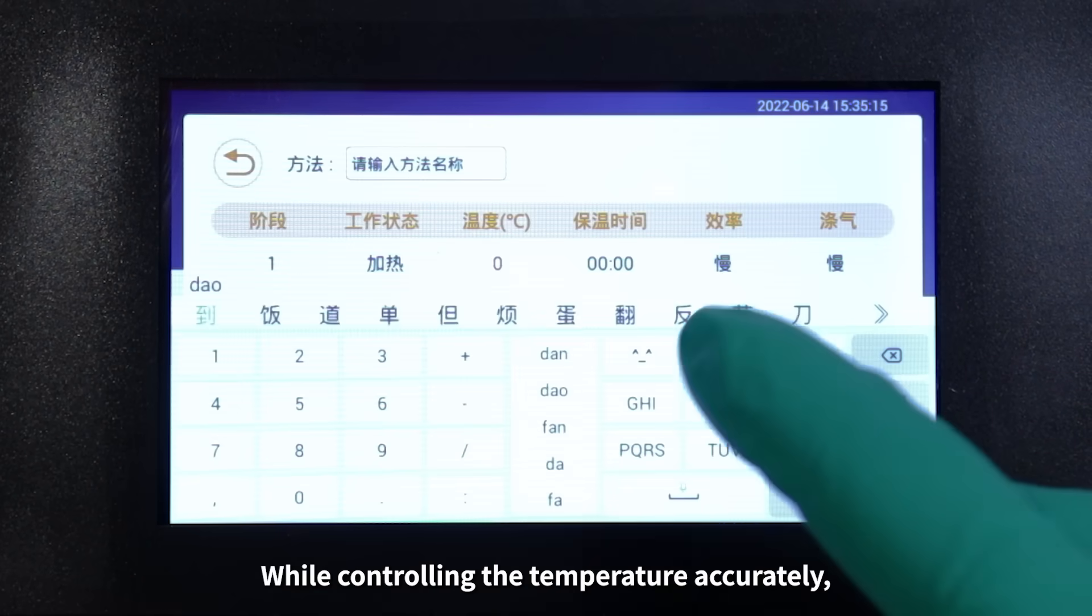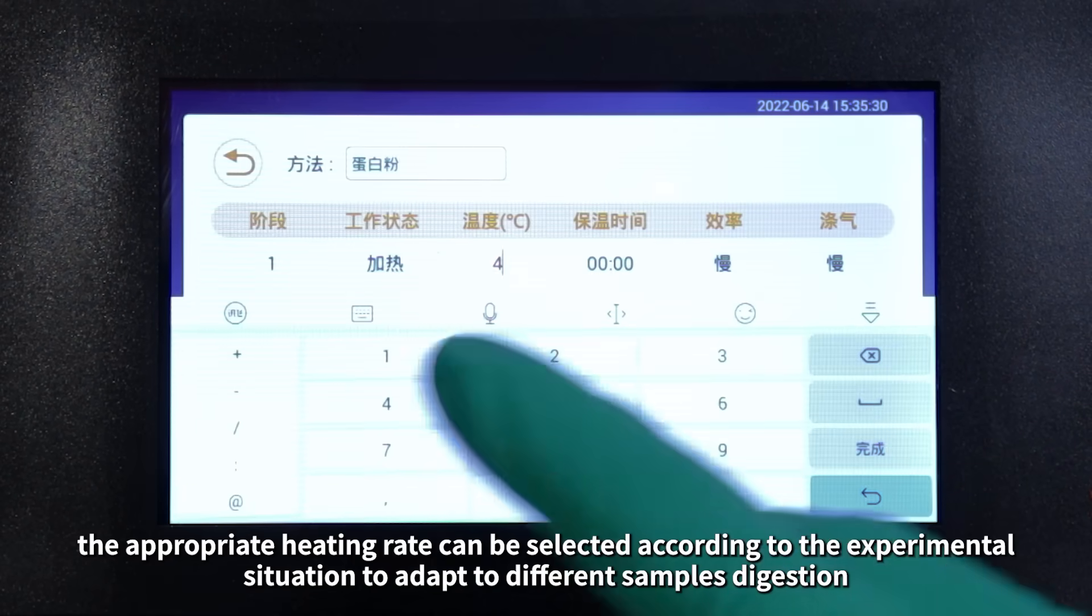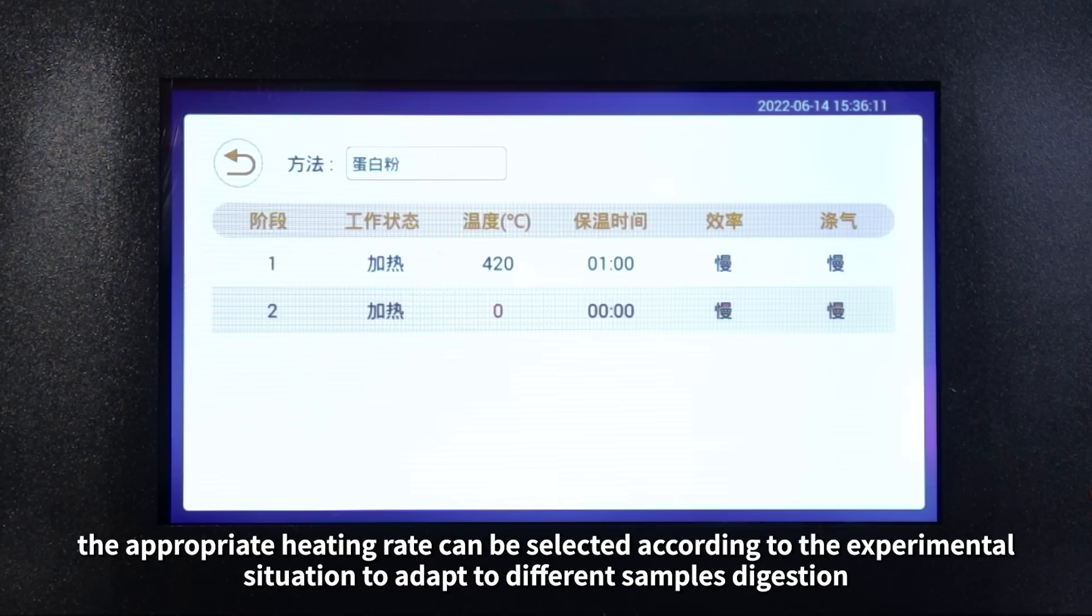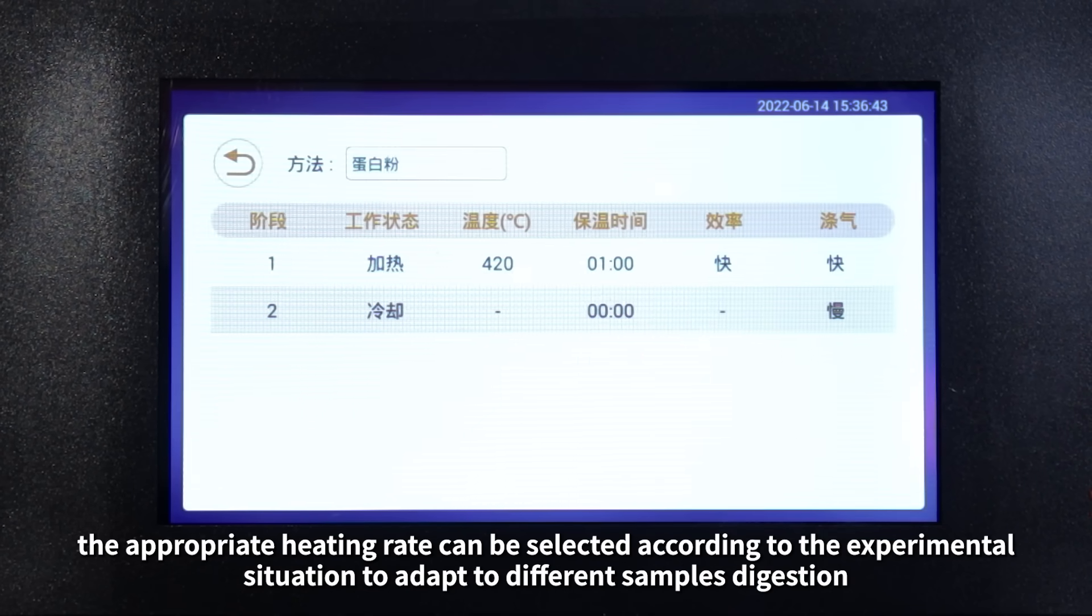Controllable heating rate allows accurate temperature control. The appropriate heating rate can be selected according to the experimental situation to adapt to different sample digestion requirements.